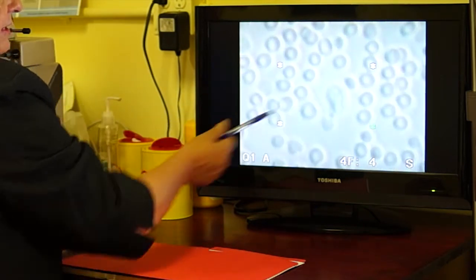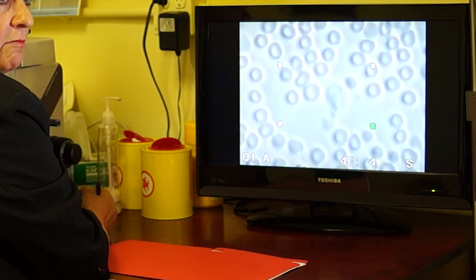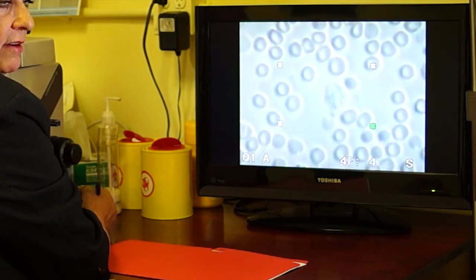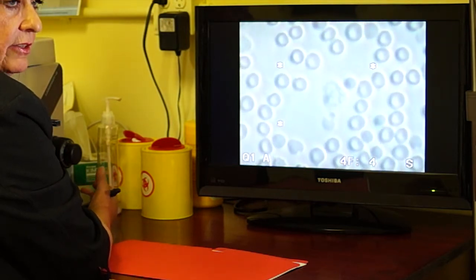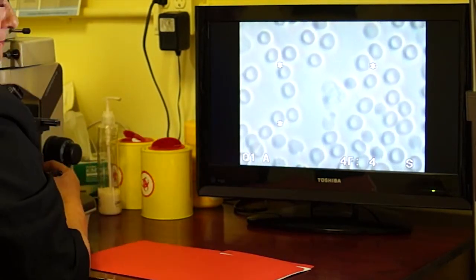Here's a white blood cell. This, in fact, is a phagocyte, and it will change shape to engulf itself around bacteria. This is a good thing, but it can release a chemical that kills the bacteria, and then it gets filtered out of your blood. The phagocytes actually change shape, whereas the lymphocytes don't.